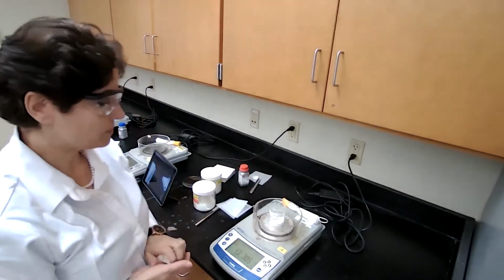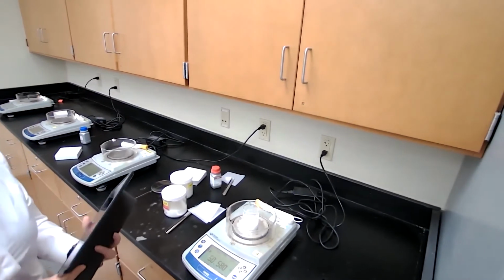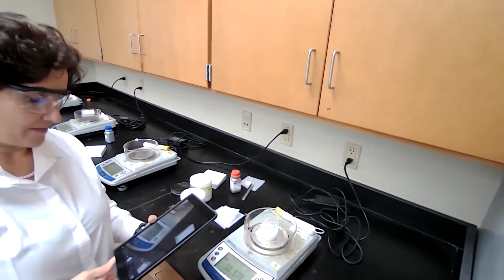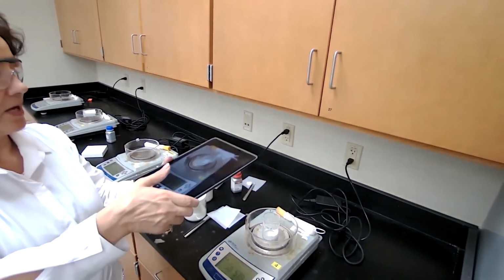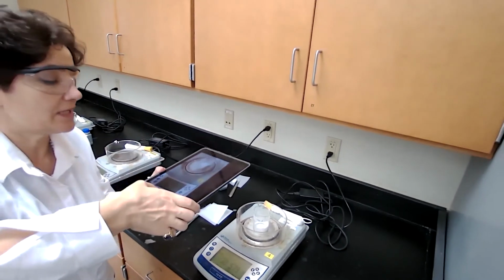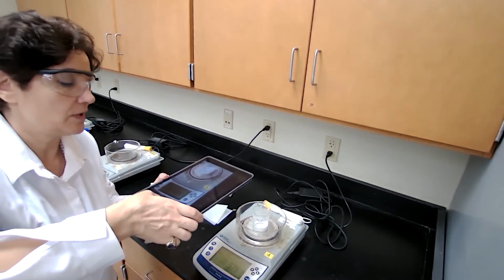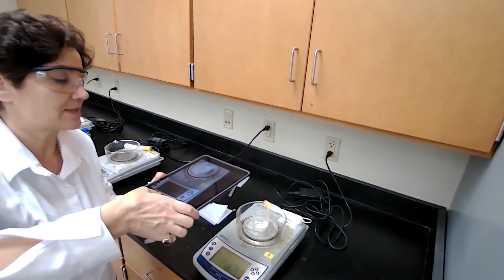Now, this is the beaker with the label. We have the empty container, now with the neutral compound. So I'm taking a picture of this to post for you, and you can report this mass.